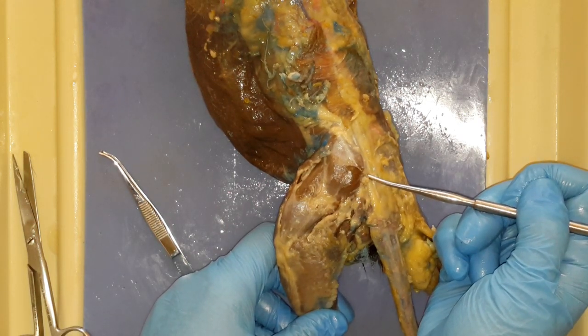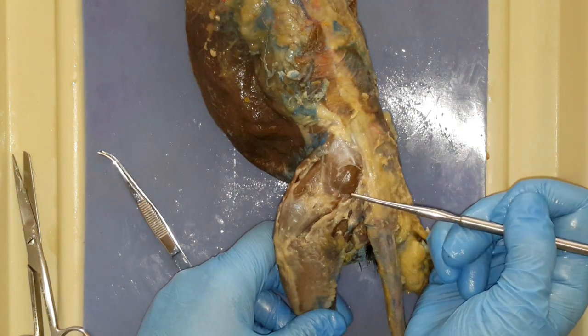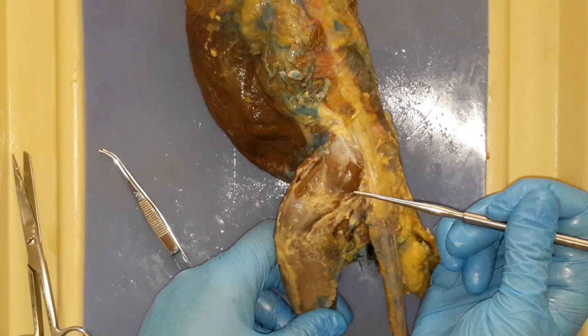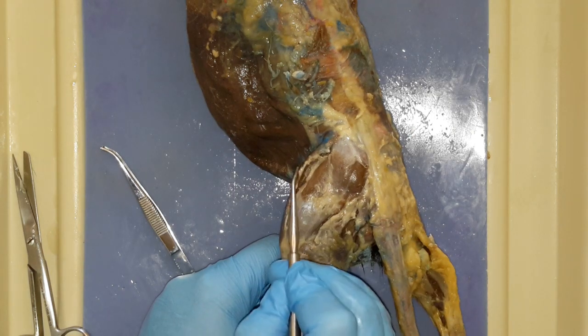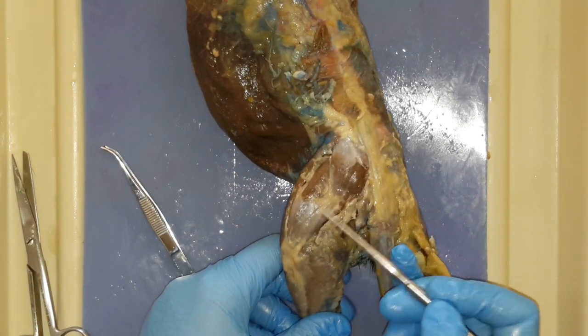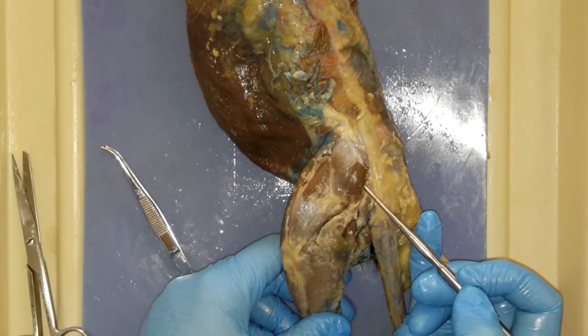So if you're looking at your book, someone want to tell me what this guy is? This is the gluteus maximus. That is the gluteus maximus. So: sartorius, tensor fascia latae — and that includes its connection, that connective tissue — and then we have the gluteus maximus.